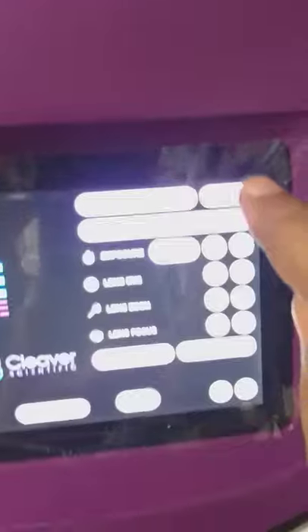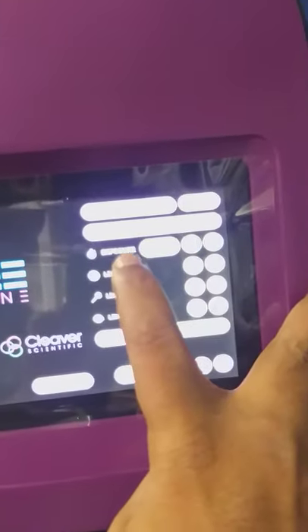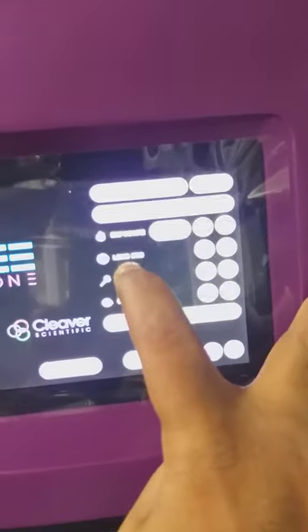So naturally it will come like this — display live, then auto. So live, auto, white light, exposure, increment and decrement. So lens high risk adjustment.